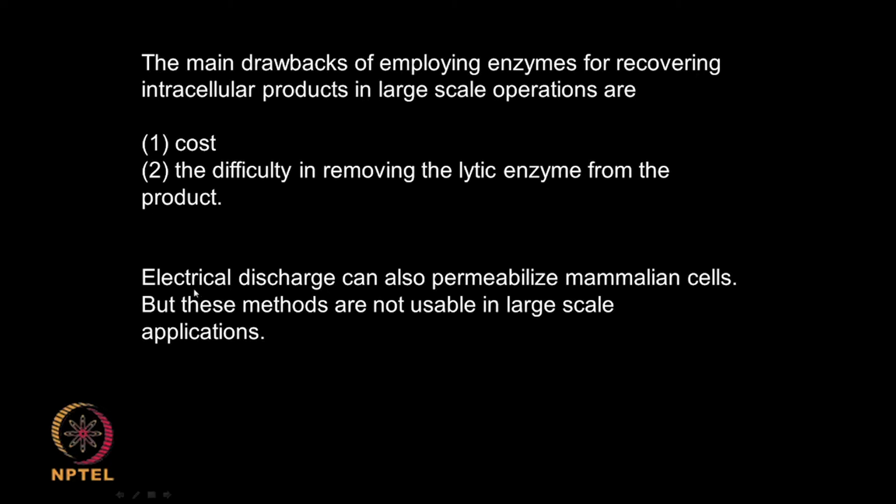Of course, there are other exotic methods like using electrical discharge method to permeabilize cells, but then they cannot be used in large scale. Maybe in very small scale, theoretical scale, one can think about using those methods actually. Okay. So, with that we conclude the cell breakage.